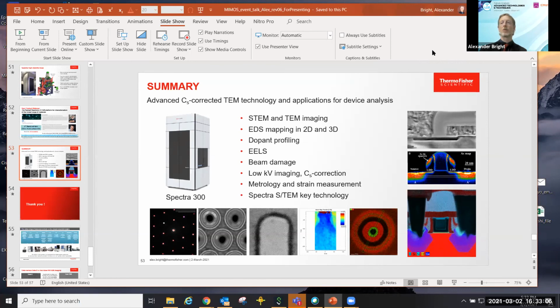On the other hand, the requirements or people's expectations about the stability have also increased. So technologies such as DCFI are very helpful. You can do a fast scan and sum the images, and then even if the site is not great, often you can get very nice looking images. So this kind of technology is very helpful to allow you to get really quite nice data, even when the site environment is not great.